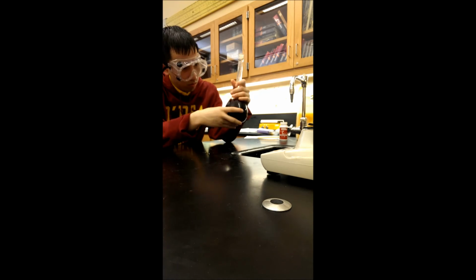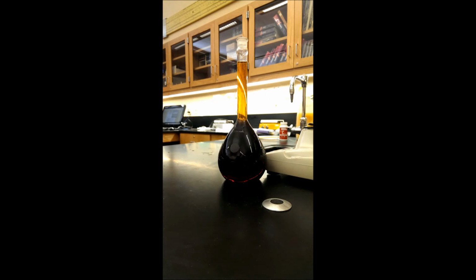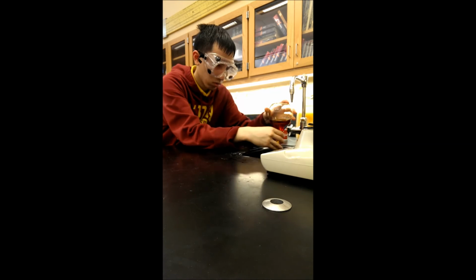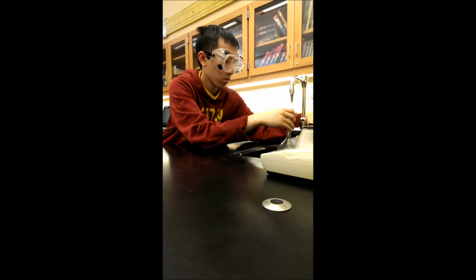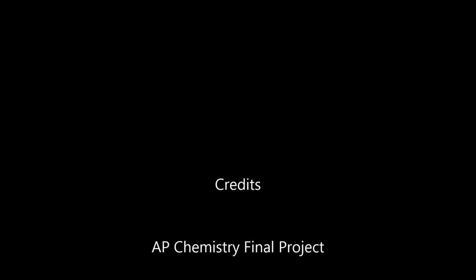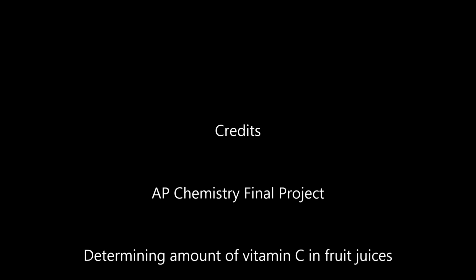But nevertheless, it was a pretty fun experiment. Learned a lot about making solutions and titrations and weird things that happen. Like, for example, I was expecting the iodine solution to be yellow because of the iodine, but it was actually really dark, so that was pretty weird.